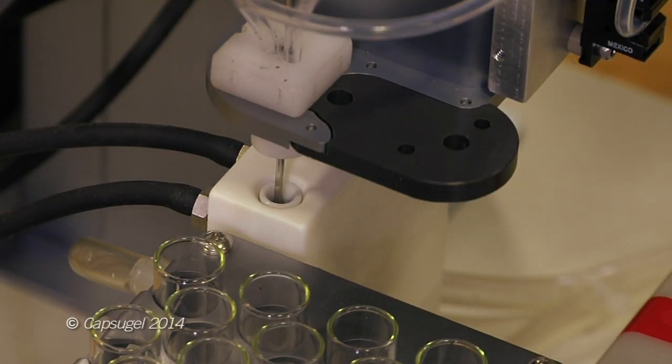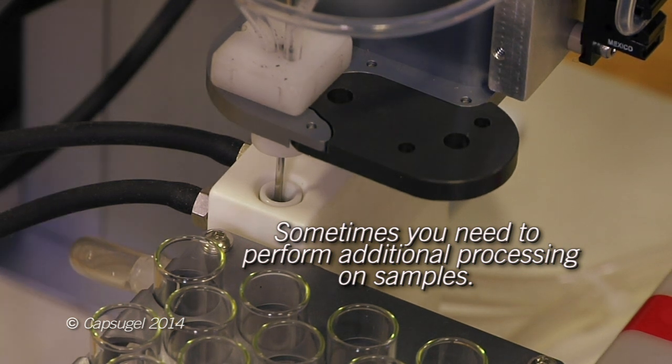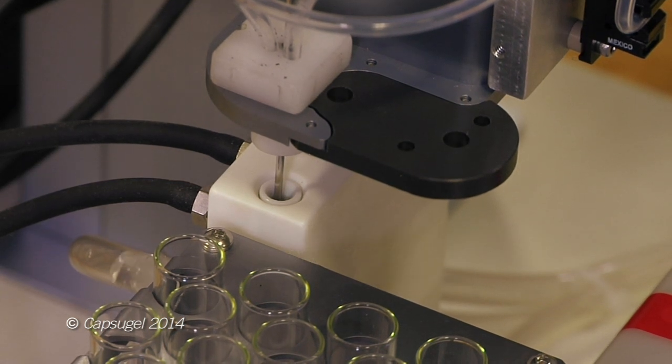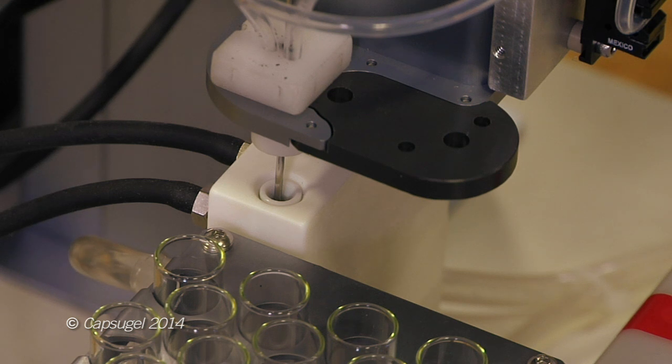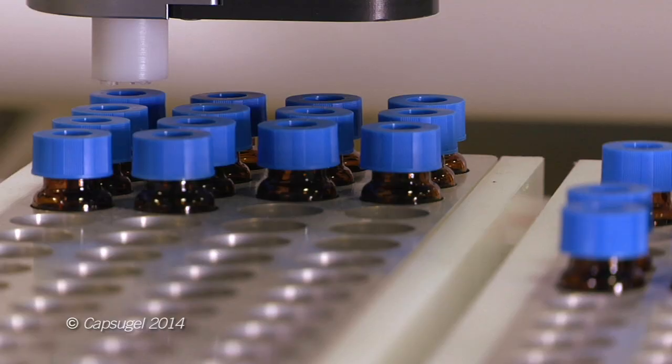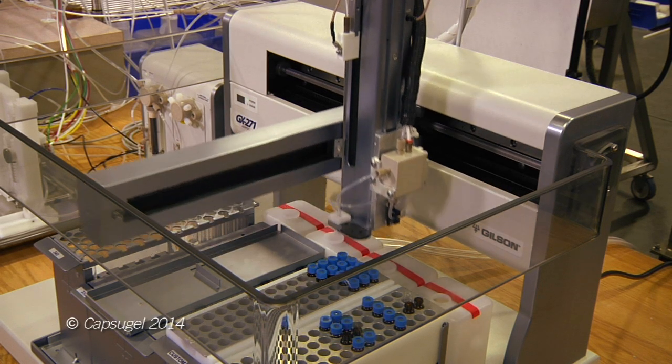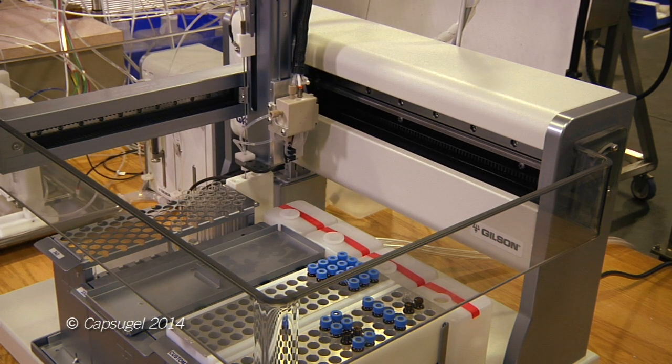Working with Gilson Incorporated, we have fully integrated the Gilson liquid handler into our MAST system. Now we can collect whole broth and cell-free samples from the cell removal system and perform additional processing on them. Further processing possibilities include dilution, extraction, digestion, forwarding on to downstream analyticals such as UPLC or saving samples as retains.